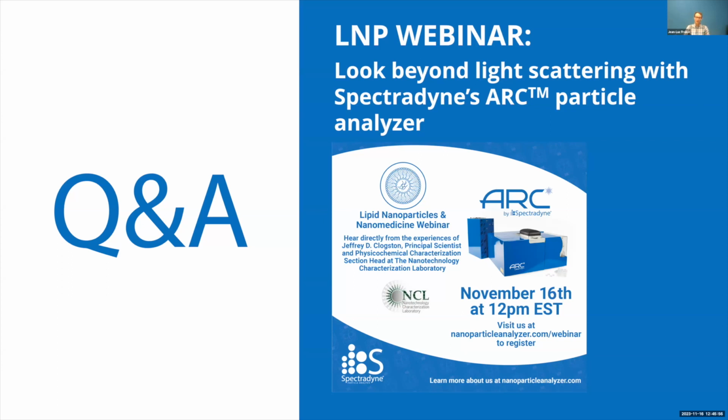It's a small fraction of the 3 microliters that you put in. And some people initially expressed reservation about that. How can you measure the concentration on such a tiny volume and extrapolate to a larger volume? But the answer is really in the statistics.